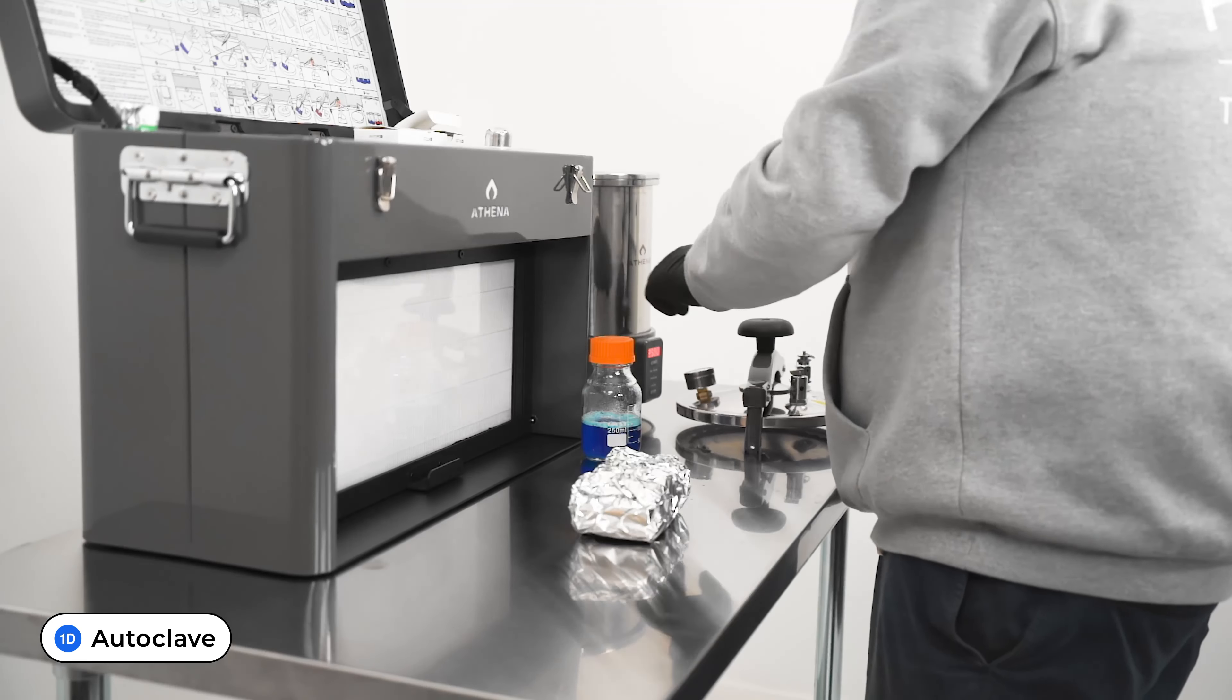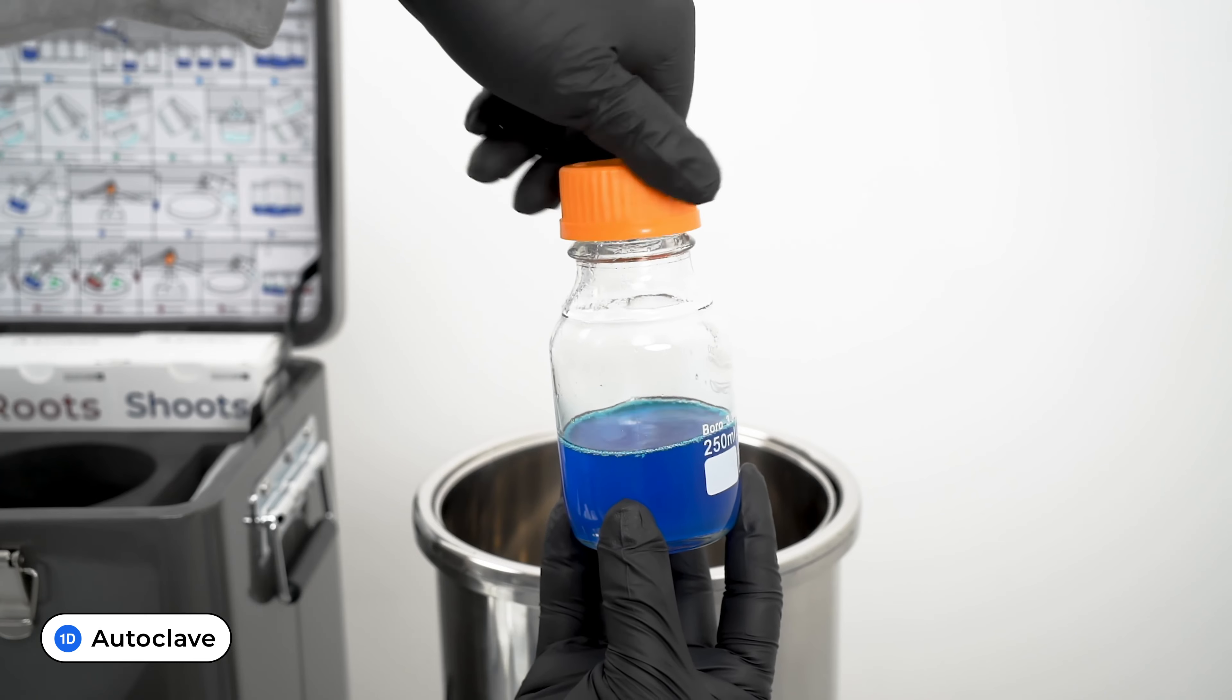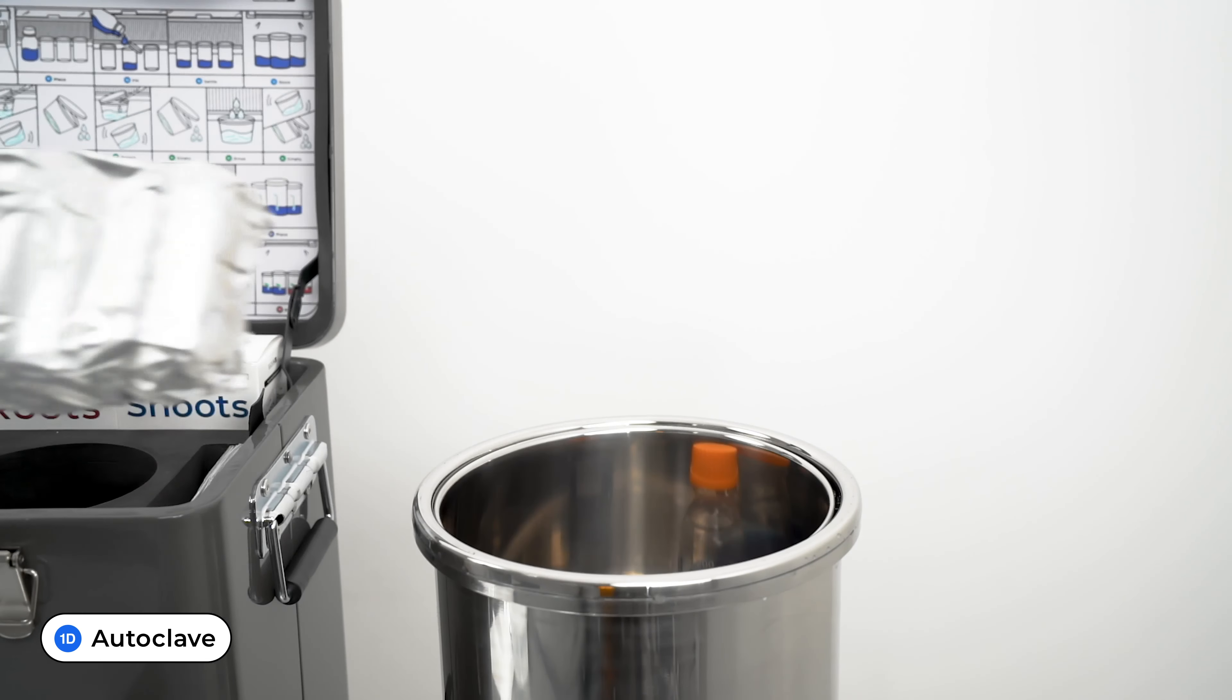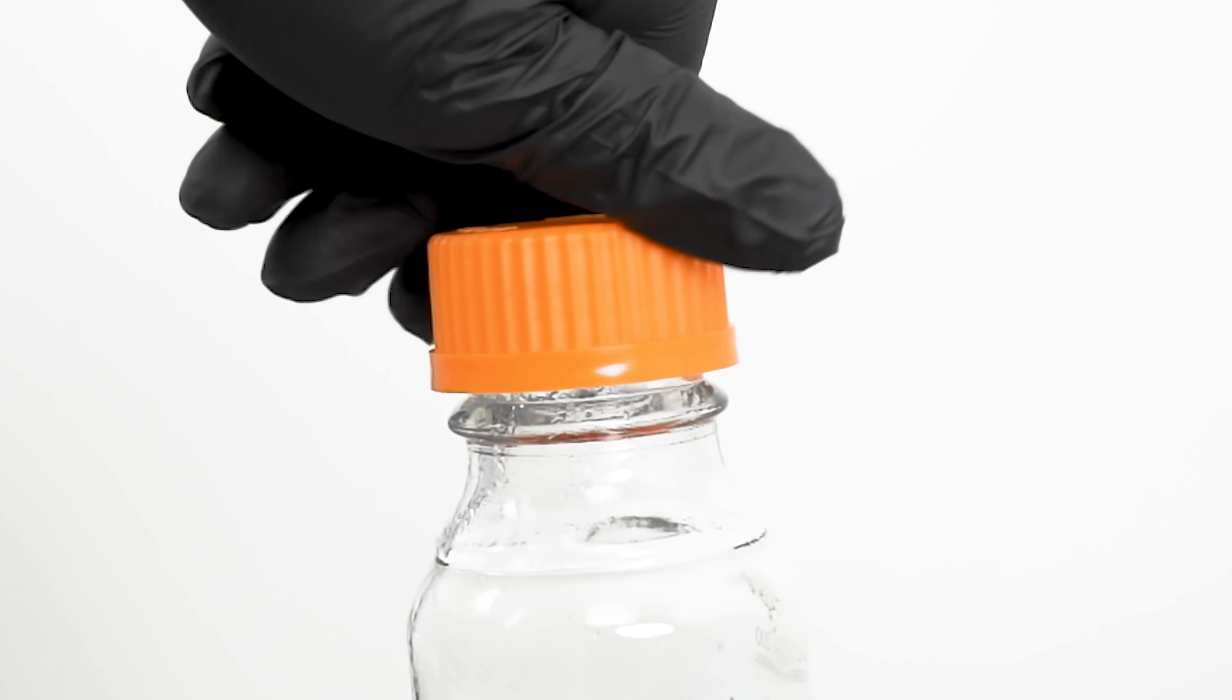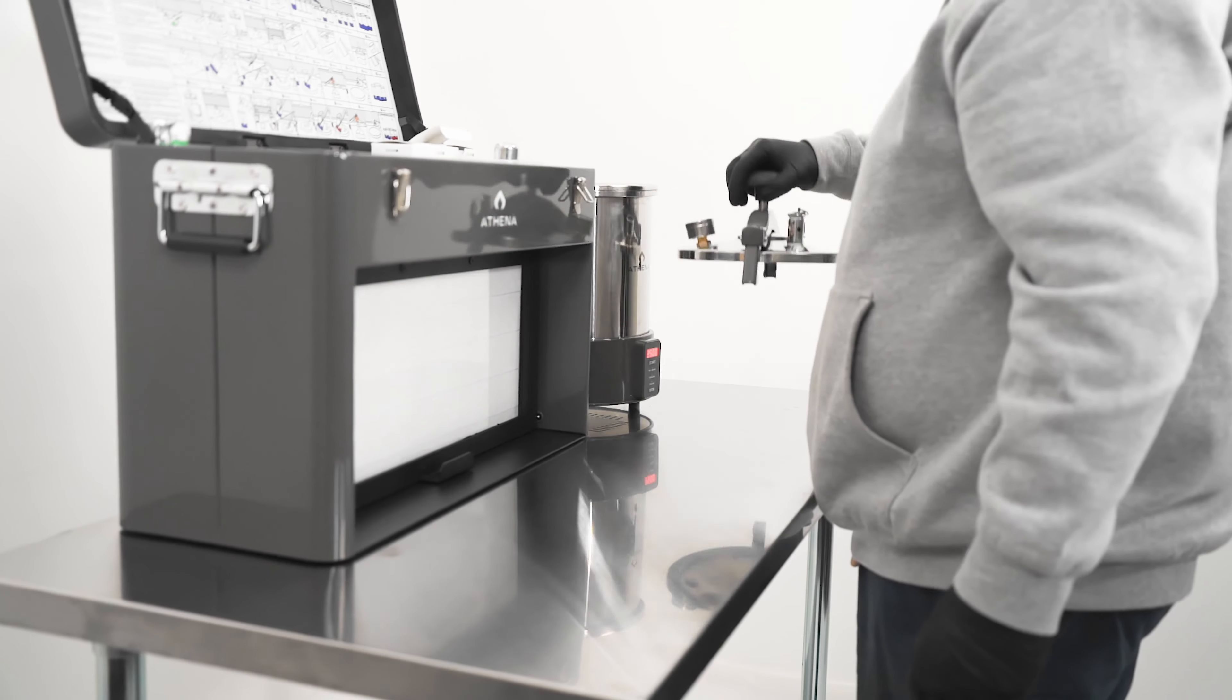Locate the exhaust valve on the autoclave lid and open it. Place the desired amount of media and culture vessels into the autoclave. Any container placed in the autoclave must have a loosely opened lid to allow for pressure exchange.